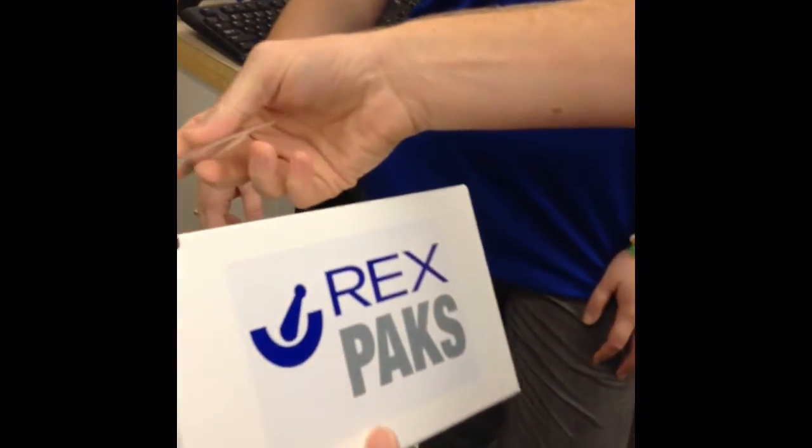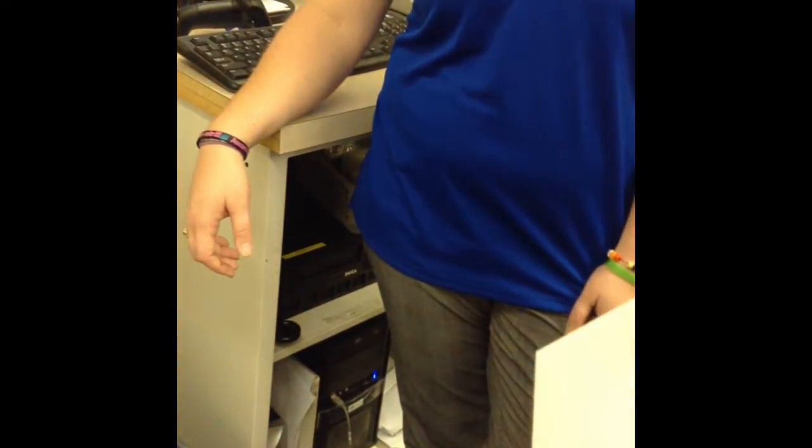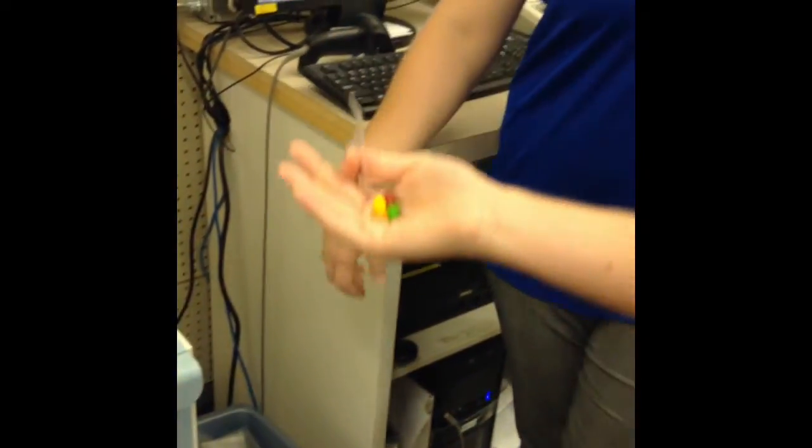And then the finished product, after we get done checking it all, looks like this. It folds nicely into a little Rex Pack box. How easy does it tear off? Really easy — try the next one out. And when you need to tear a sample off — excellent. I only had to do that to see if I could eat those. Enjoy.